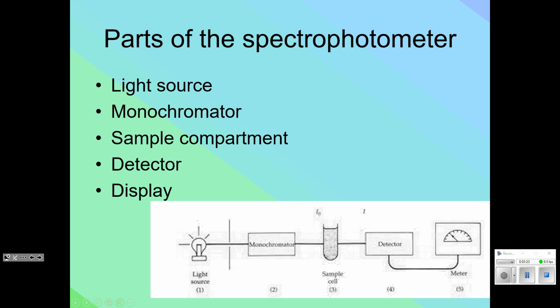What we will be able to do then is use some mathematics with that value in order to determine the concentration of the solution. So typically what we do, like what we're going to start with next class period, is we are going to measure how much light passes through a known concentration. Then we can do a little bit of math, maybe make a graph like a line. And then we're going to put something in that sample cell that's an unknown concentration. Doing a little math, we can figure out what the concentration is. That's basically the lab next time.